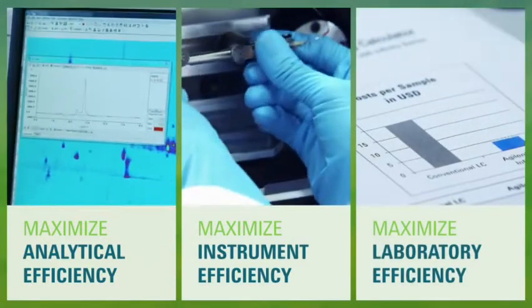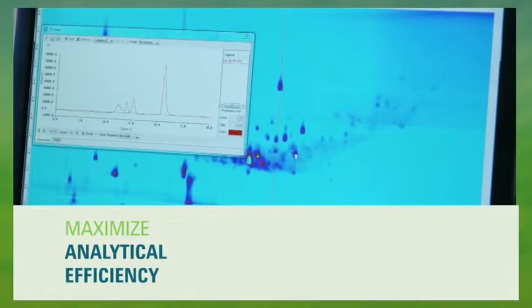Analytical efficiency determines the quantity of your data for confidence in your results and in your business decisions.